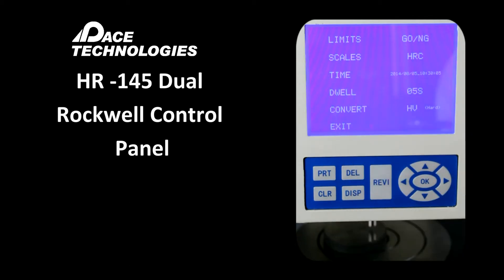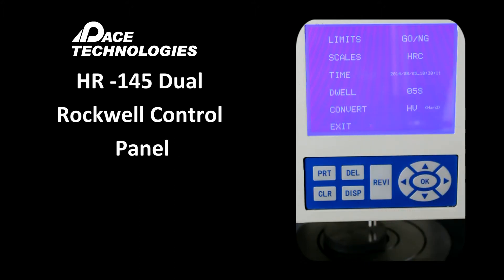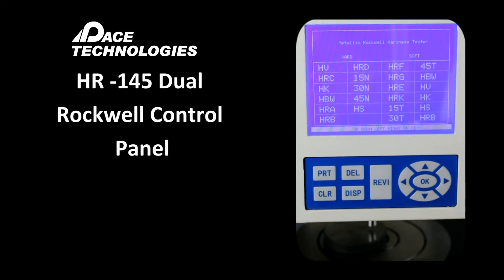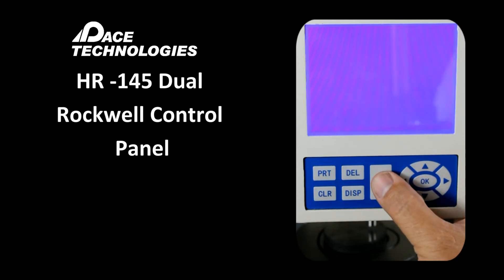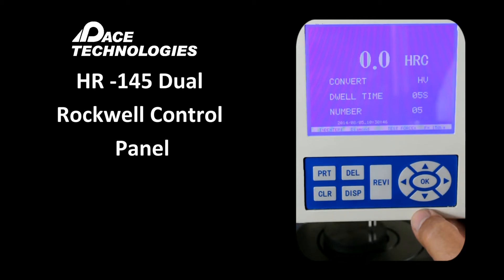The time setting provides a date stamp that goes to the printer. The dwell time controls how long the major load will be applied to the sample. The convert function allows electronic conversion to another scale, though it should be noted that conversions are not a one-to-one mathematical correlation. We'll leave that set to HV, which is Vickers. Those are the parameters in this menu; press OK to exit.